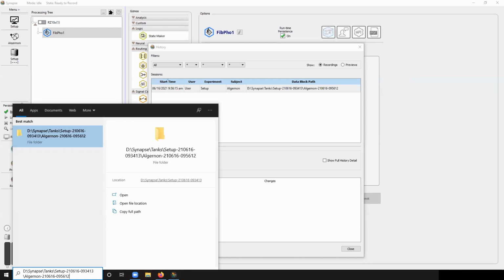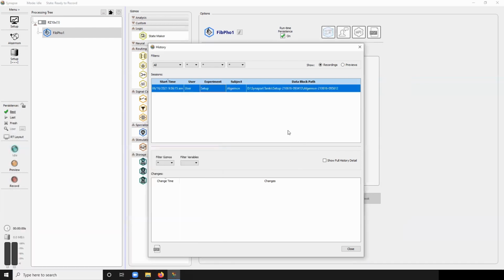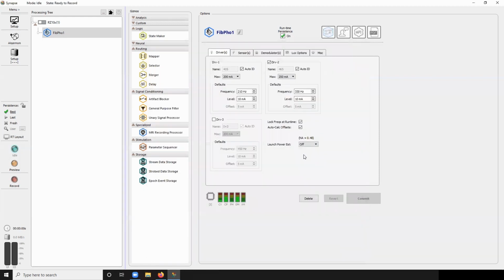You'll see that it copied the file there. Now, the most important thing is in Python, when you go to import the data, these slashes need to be reversed, or you have double slashes. It doesn't like the file path where the slashes are the backward slash.